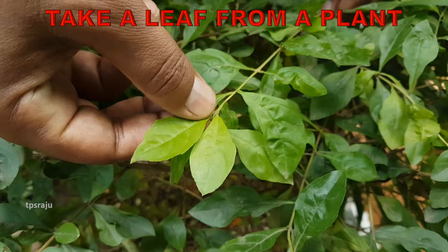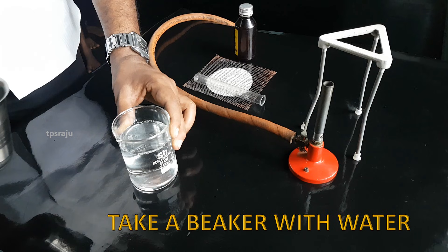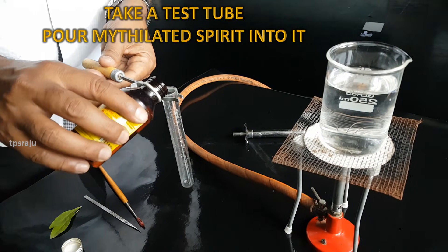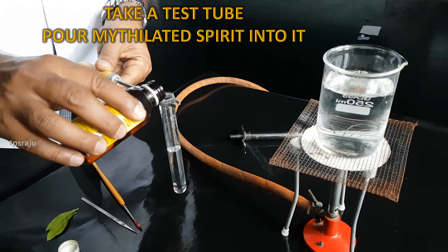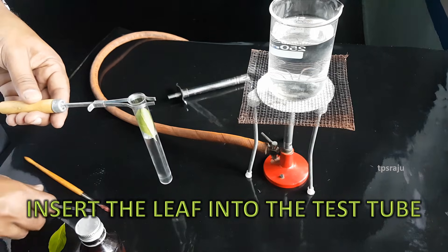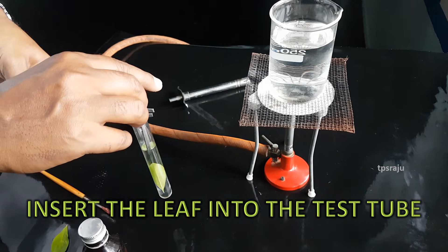First we have to take a leaf from a plant. Then take a beaker with water. Now take a test tube and pour methylated spirit into it. Insert the leaf into the test tube such that the leaf should be immersed in the methylated spirit.